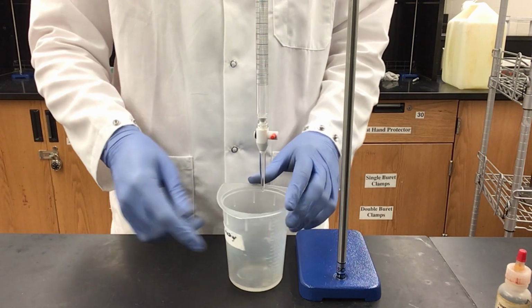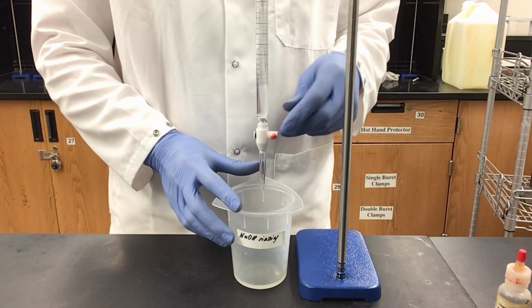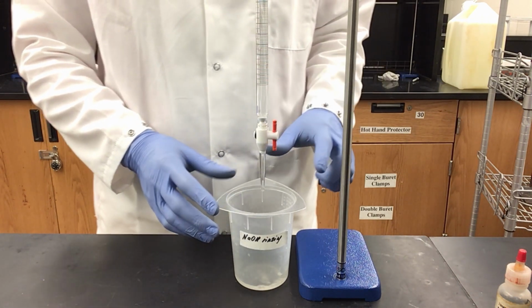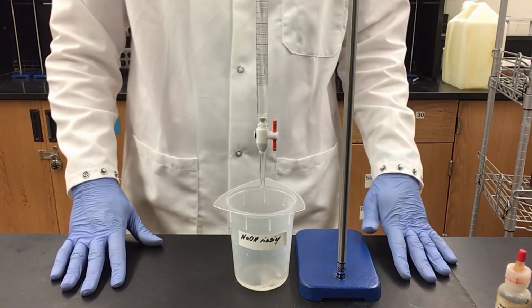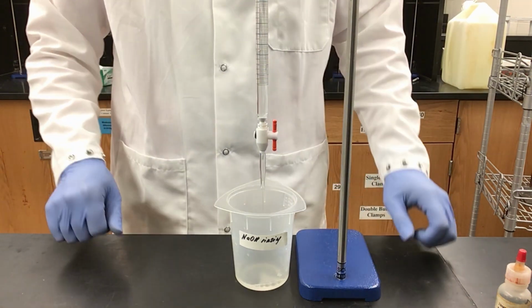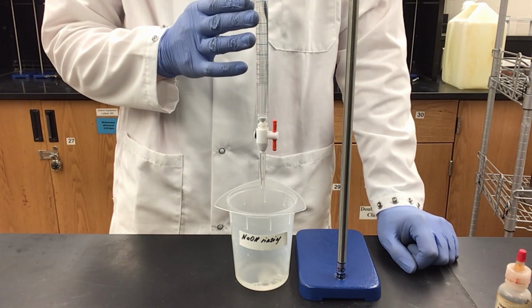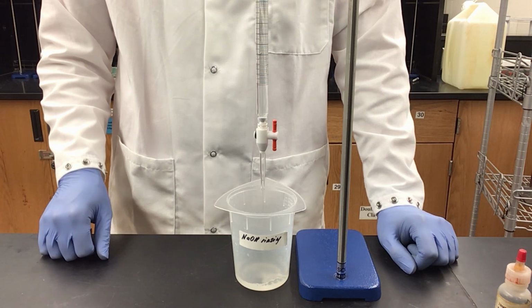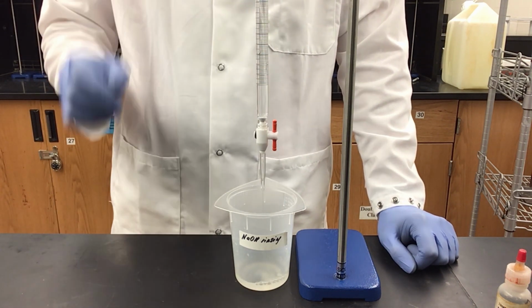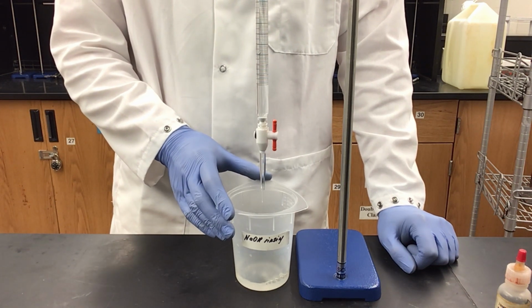Now that we are at the end of the lab, I need to take care of the sodium hydroxide still within my burette. So I have my rinse beaker here. I'm just going to empty the remainder of my sodium hydroxide into my beaker, and this will be disposed of in the acid-base waste in lab. And then once I am done, I will take the emptied burette, flip it upside down and clamp it to my double burette clamp. That way it is ready for use for the next lab.